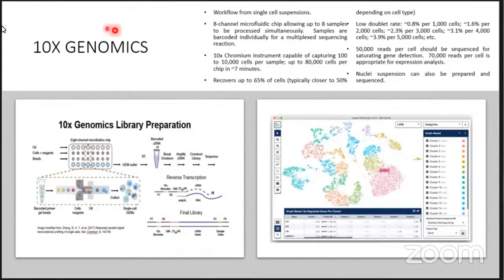So this is from 10x Genomics. They have an end-to-end solution. They have the bioinformatics pipeline as well. I'll show you some of the important steps and the visualization from 10x Genomics, which are open source.